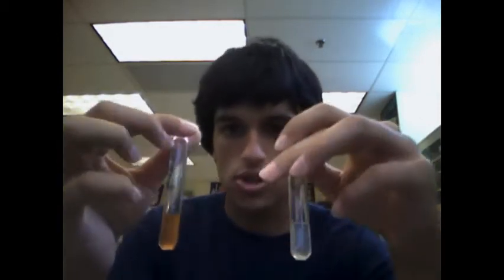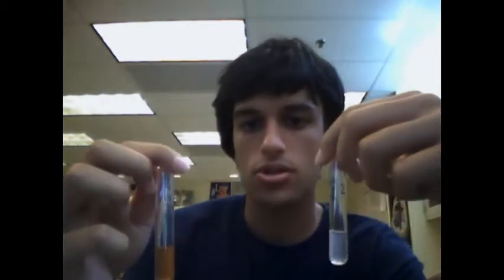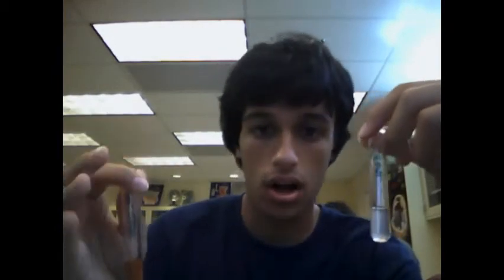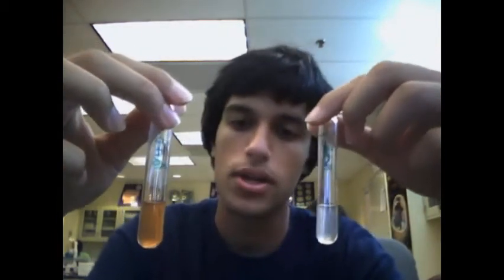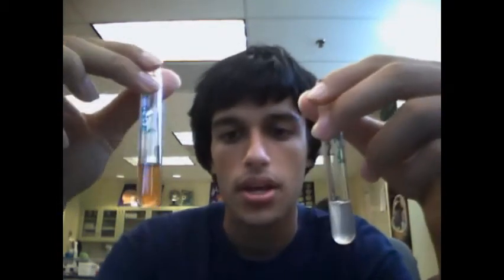As we were talking about before, I only have 2 of the test tubes right now because the third test tube, with only the catechol and the water, we are continuing to incubate, to see if we can get any chemical reactions from it.